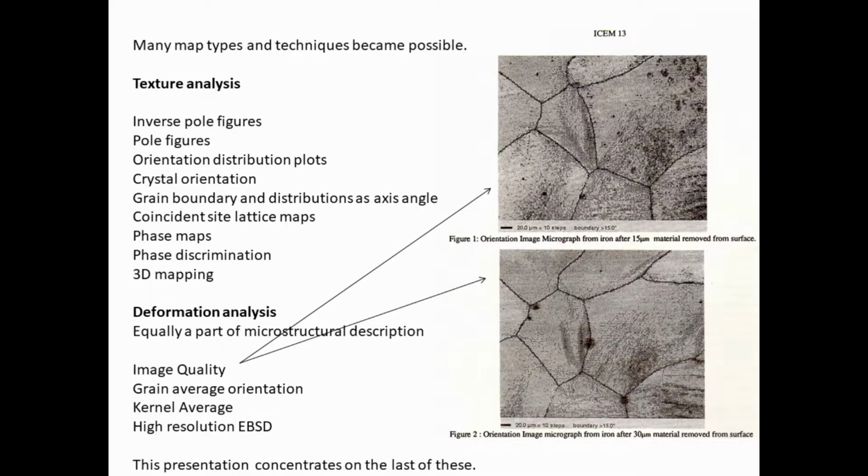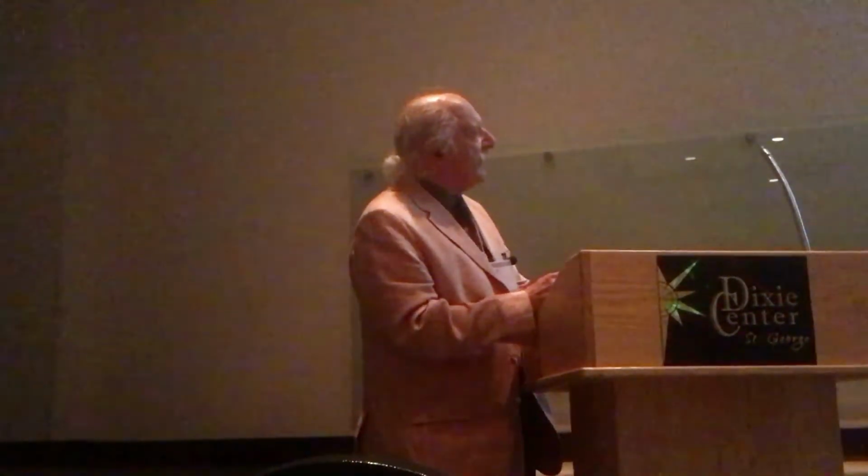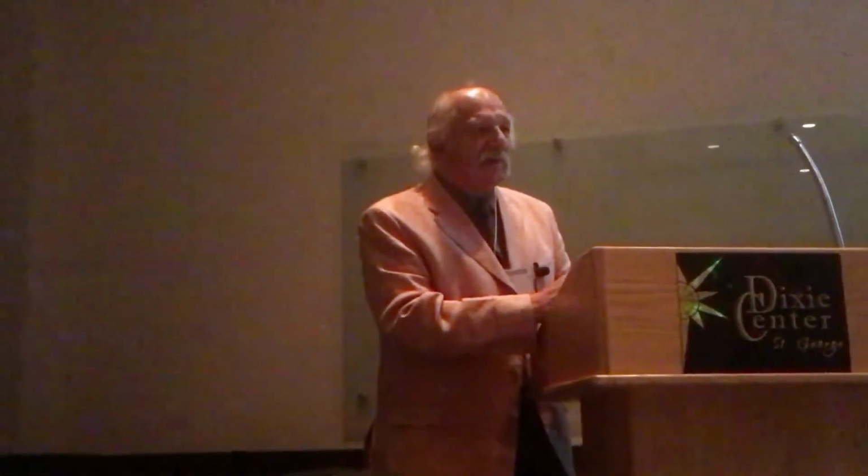But the deformation inside the sample is just as important as all these other characteristics here. Without knowing the strain distribution or the stress distribution, you're blind as to what's going to happen when you then subsequently put this material under constraint or in a furnace. So the determination of the residual deformation in your sample is as equally important as this.